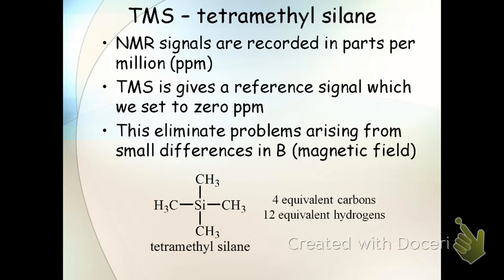Your spectra will look slightly different if you have a stronger field. You usually get more separation between your groups. But in terms of position, the peaks are the same whether you have a 1 Tesla or 2 Tesla magnet. And if I remember right, I had to go quickly look it up, Tesla is the unit for measuring magnetic field strength, abbreviated T.